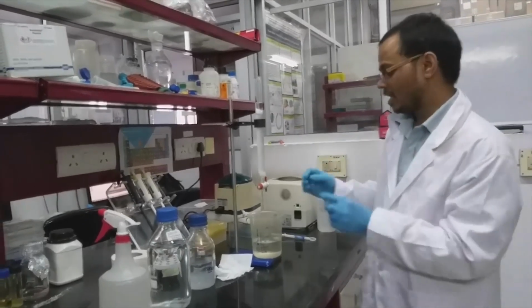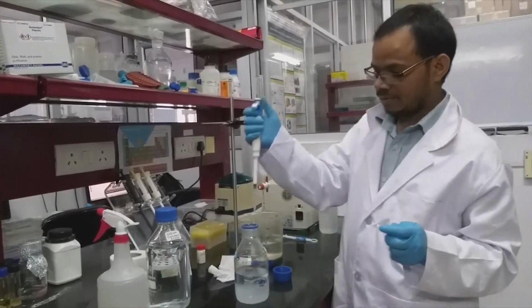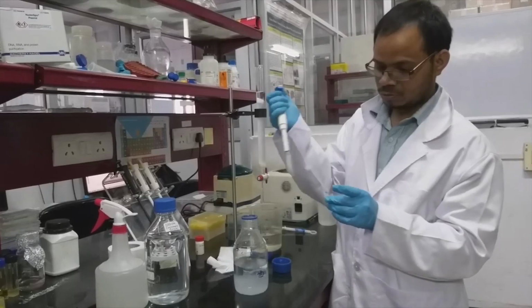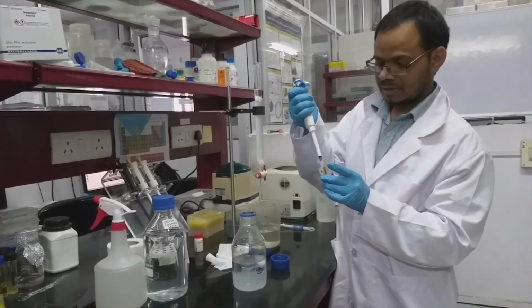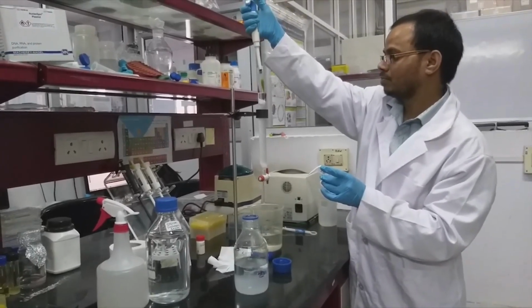So we will load the sample. I will add the beads to the sample, and this sample I am going to load on top.